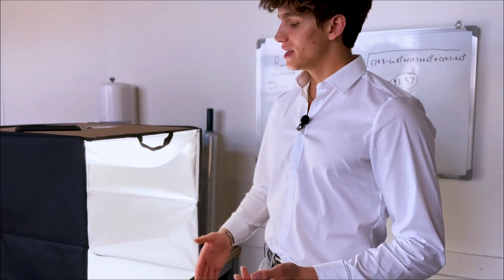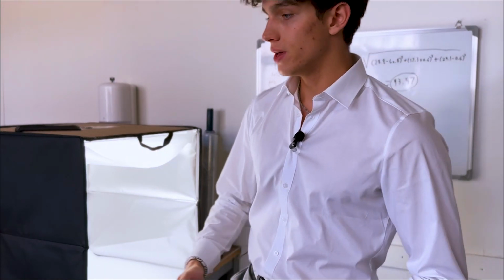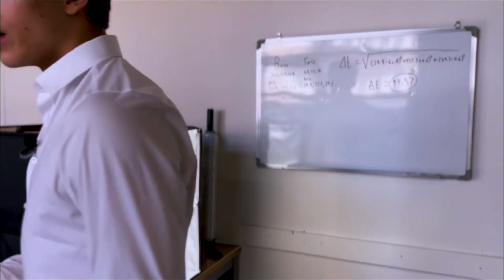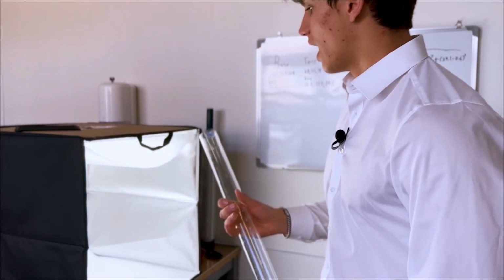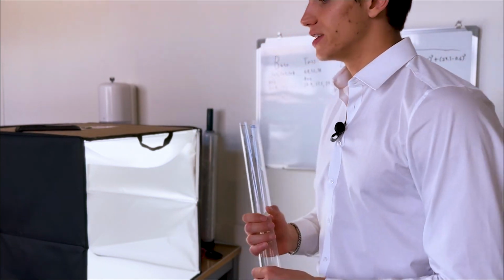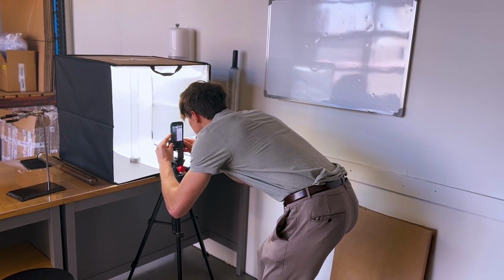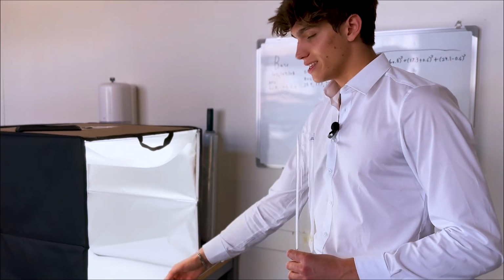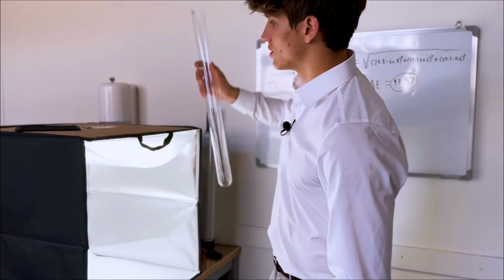So what that means is I've set up a light box to optimize the physical condition. This is gonna remove the majority of reflections on this piece of glassware, which you'll see momentarily why that's so essential. And then I've also set up a tripod that's currently used to take this video, otherwise it would be right here. And this tripod is at uniform distance from the light box, so it's the same every single time. And essentially, this procedure goes as follows.